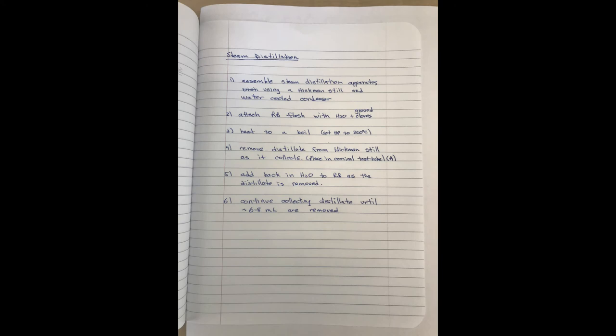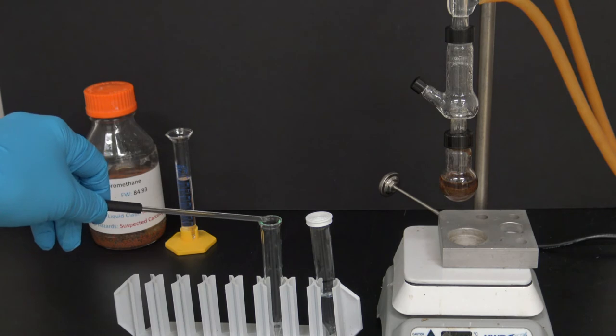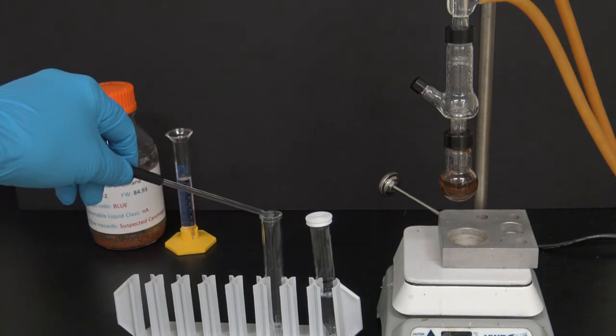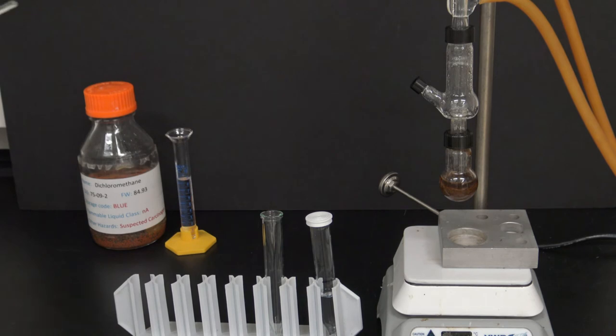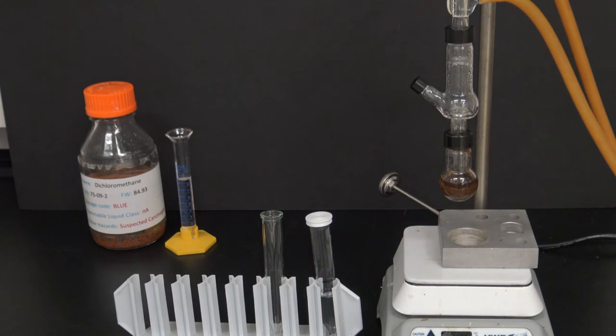This is my notebook page for the steam distillation portion of this experiment. Well, I've cleared a few things out of the way and I've brought in some more things. So right now, I have brought in a new, clean, dry, conical test tube. I have brought in some dichloromethane or methylene chloride. I've taken 9 milliliters of that and put it in my graduated cylinder.